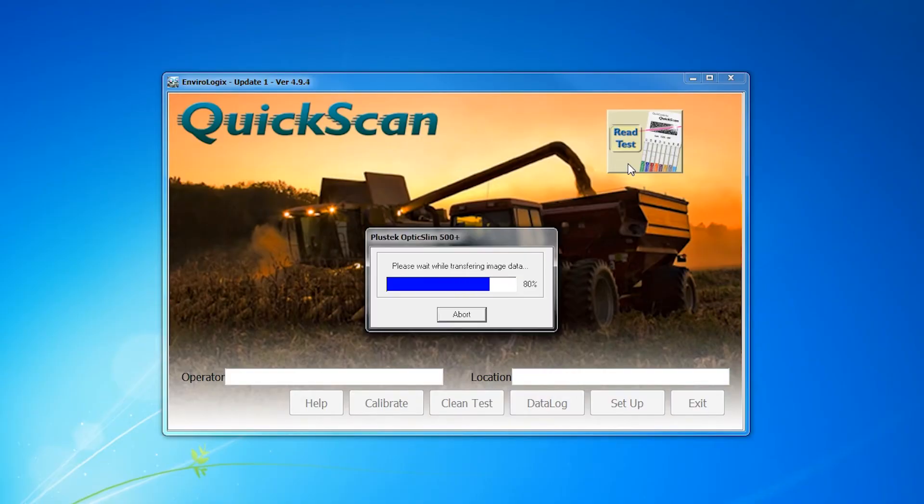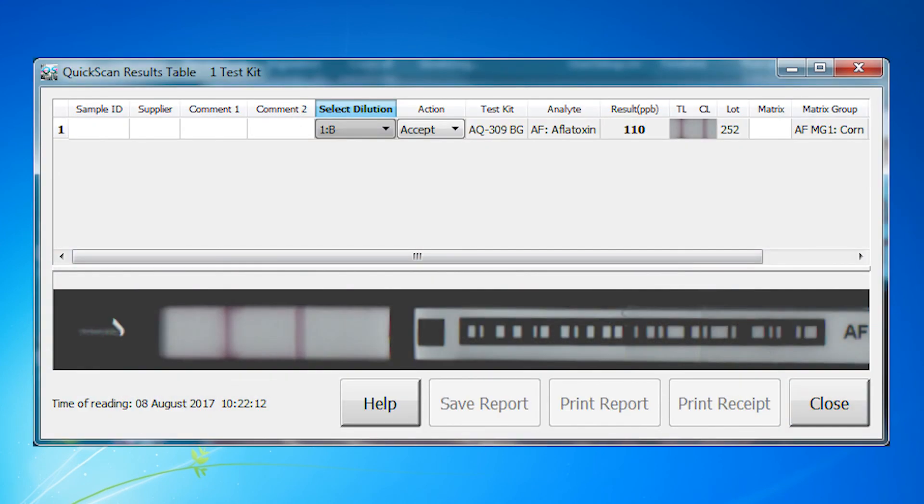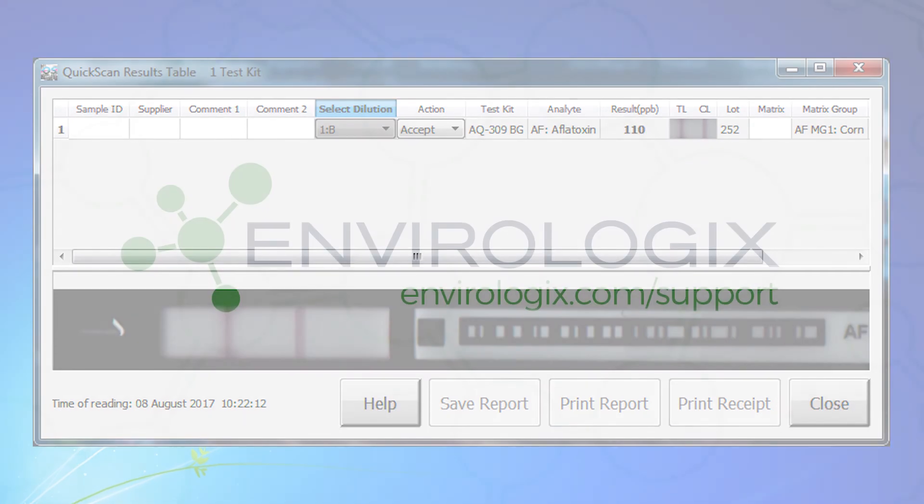Step 6. On the quick scan results screen, choose 1B under the dilution tab drop down menu. The system will calculate and record the aflatoxin level in the diluted sample. Adjusted results are valid in the range of 100 to 300 parts per billion.